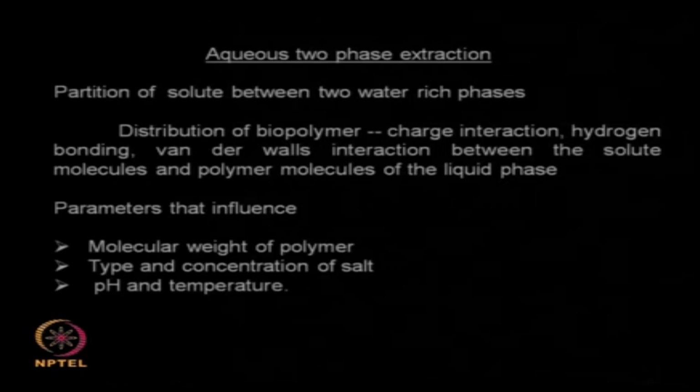As I said, suppose I have water in which I have certain proteins which I would like to extract, again with water itself, because as I said before, proteins are very sensitive to solvent environment and they may get denatured. So you would like to use water itself as an extracting medium. How do you do that?